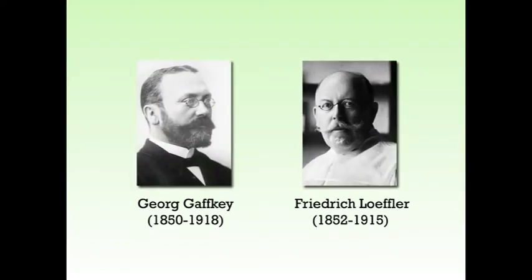So now we'll see the streak plate method. The streak plate method is used for obtaining discrete colonies and the pure culture. This method was developed by Loeffler and Gaffky. In this method, a sterile inoculation loop dipped into a suitable diluted suspension of organism is then streaked on the surface of the solidified agar plates to make a series of parallel, non-overlapping streaks. The main aim of this technique is to obtain colonies of microorganisms that are pure.